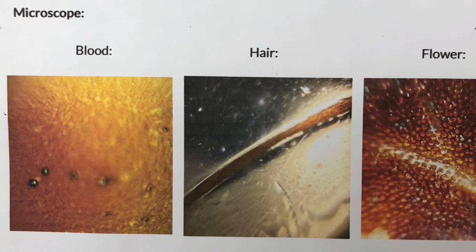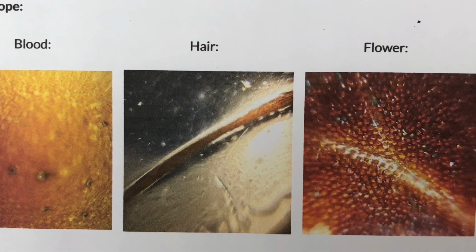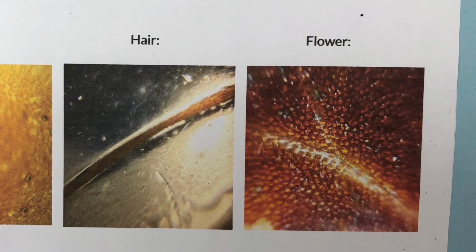The first image is a sample of uncentrifuged blood, therefore you can't see the individual cells. However, if it was centrifuged, you would be able to see them. The second image is a hair sample, and the third image is some flower cells, all underneath the paper microscope.